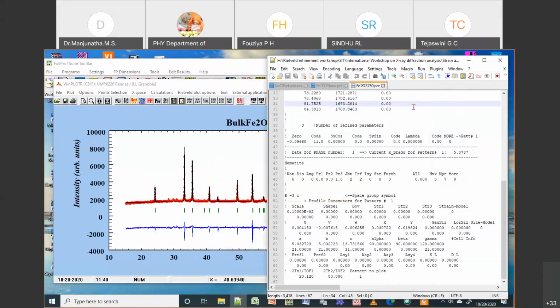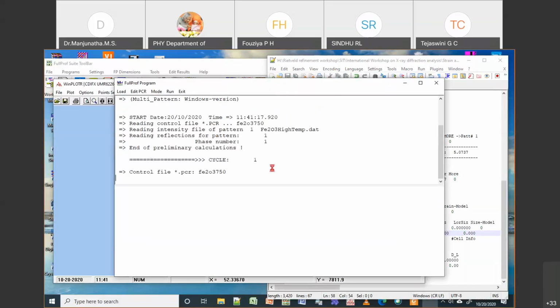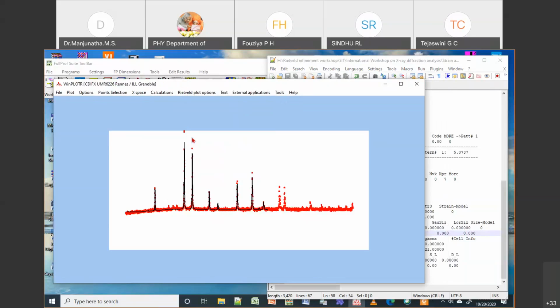So then what I will do is I will just try to do the refinement of X and Y. Okay, so this I'll put, so the maximum is 3, so now it is 41, and then this is 51. Okay, so I'll try to finish it fast, so then I can complete the other things. So I think it's okay, 1.81. So just for demonstration, I think it's fine.